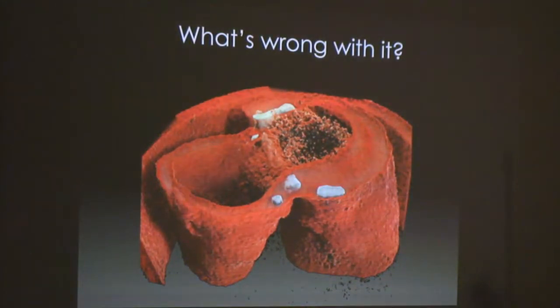Okay. So I've shown you these images, and they may look nice, they may provide some information. So you might be able to see where the walls are, where the calcium is. But essentially, this is still me artificially assigning colors. So remember how I said before that CT works on density. Well, this is the same thing. It's me guessing and saying, well, this looks reasonably dense.